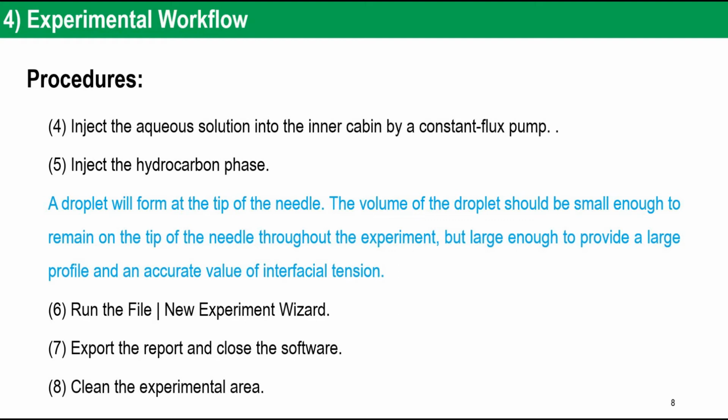The next step is to run the file and new experiment wizard in order to get the interfacial tension data. Export the report, close the software and clean the experimental area after the experiment.